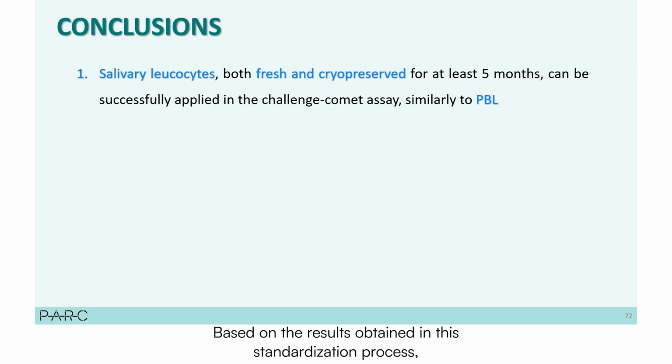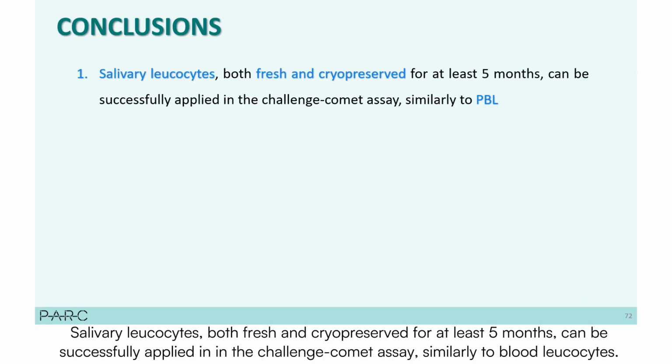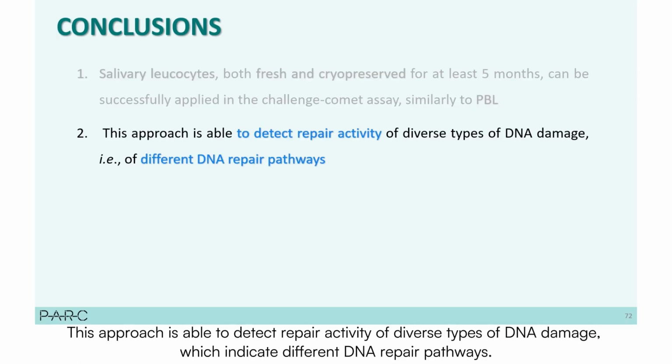Based on the results obtained in this standardization process, the following conclusions can be drawn. Salivary leukocytes, both fresh and cryopreserved for at least 5 months, can be successfully applied in the challenge-comet assay, similarly to blood leukocytes. This approach is able to detect repair activity of diverse types of DNA damage, which indicate different DNA repair pathways.